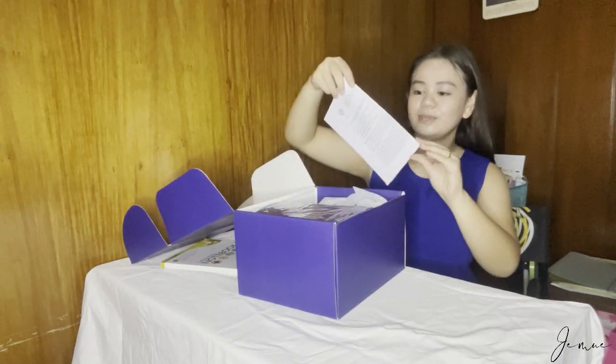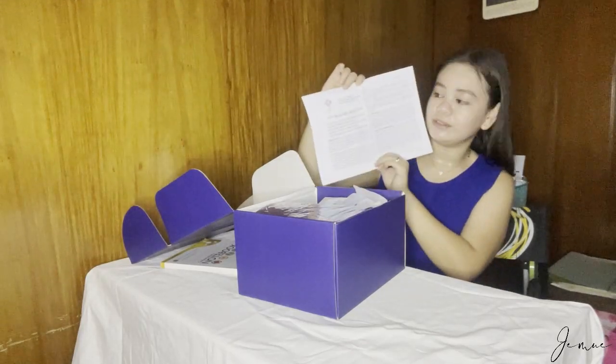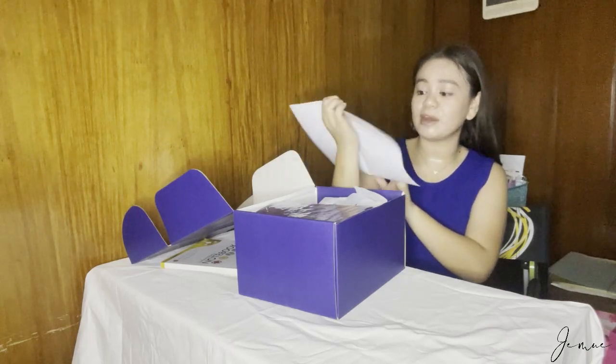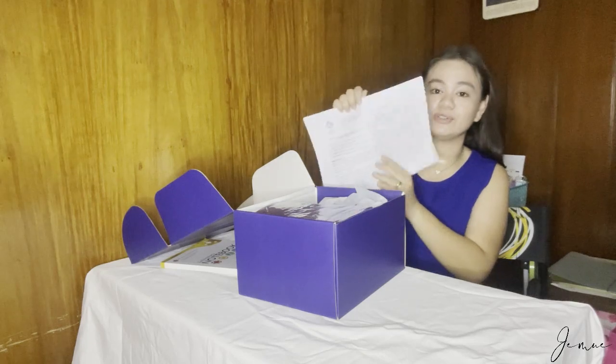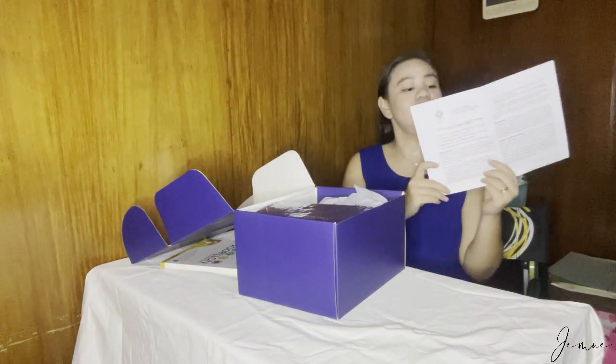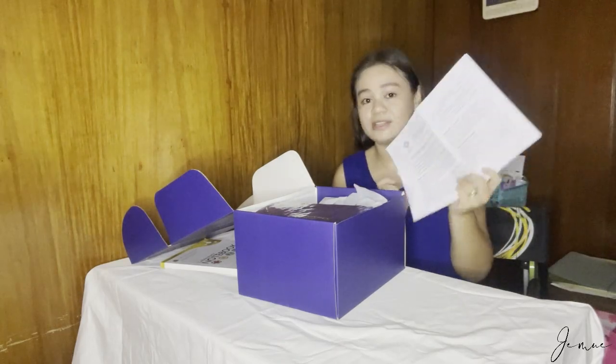First, we have some reminders about the safety. We have some reminders here — nakalagay dito: "Do not start any experiment without the proper preliminary laboratory instruction." Basically, mga safety reminders lang naman to.